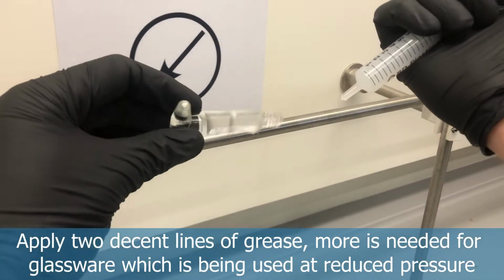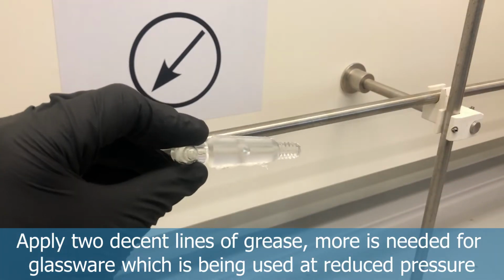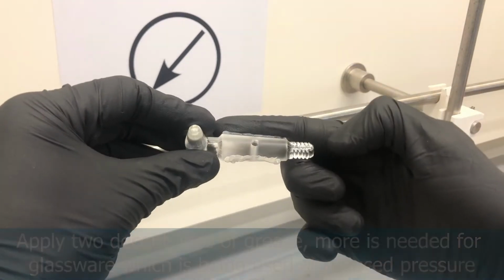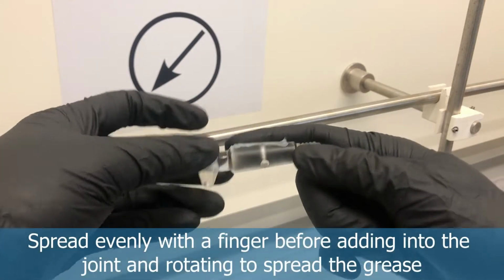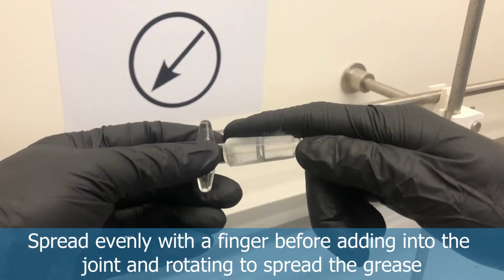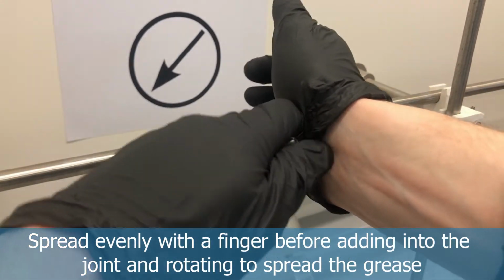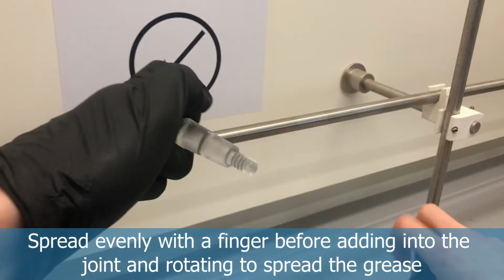This is a bit more than what you'd normally do for other types of glassware because it needs a little bit more because we're working at a lower pressure. We need to be able to really seal in our joint to avoid any air leaking in. You can spread it around the tap before adding it into the joint, although this isn't totally necessary. It's just something that you can do to avoid any excess grease being pushed off.